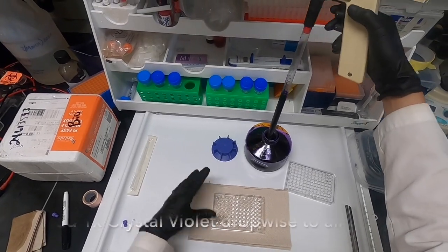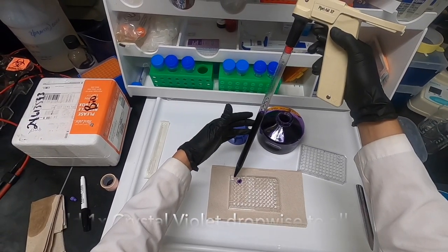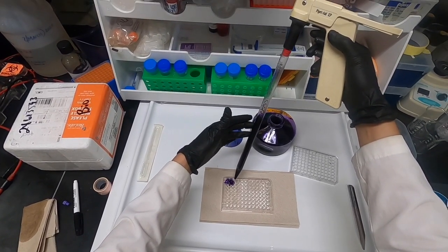We then proceed to aliquot the crystal violet stain drop wise to all wells. Be sure to work quick in order for the wells to not dry.